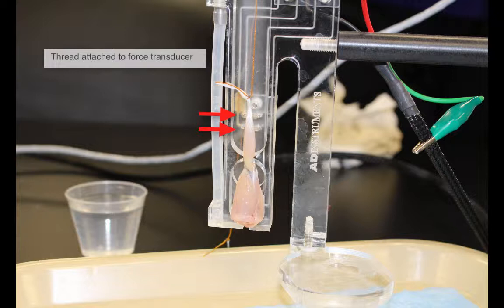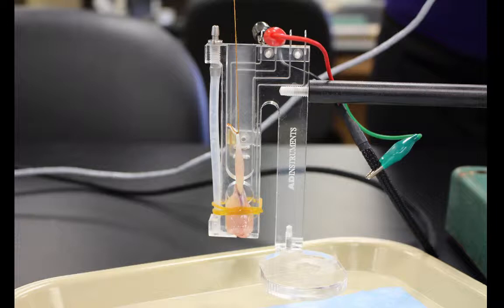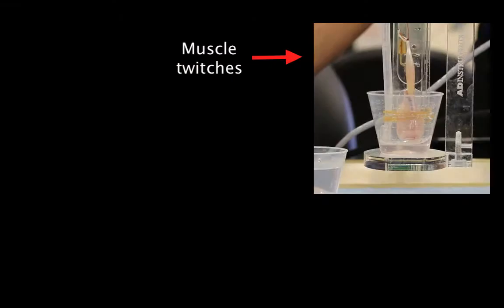The muscle minus the tibial fibula and the foot is then placed in the muscle holder against two wires which will deliver the stimulus voltage. An elastic band is placed around the muscle to hold it firmly in place against the wires, and then finally a cup is placed underneath the apparatus so it can be bathed with ringer solution.